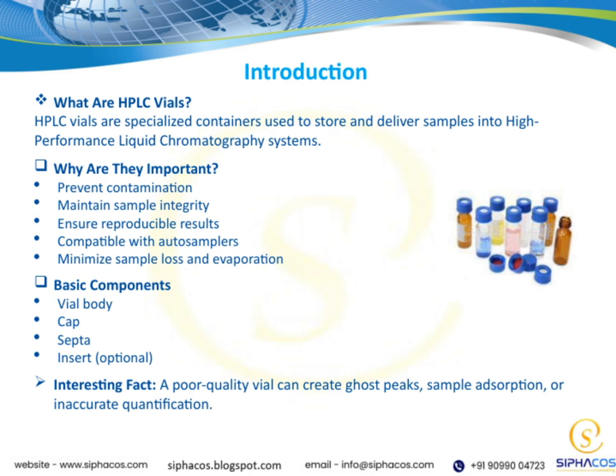Here's an interesting fact to remember. A poor quality vial can lead to ghost peaks. These are misleading signals in your chromatogram, or cause sample adsorption, which skews your results and can even lead to inaccurate quantification. So, investing in good quality vials is vital for reliable chromatography.